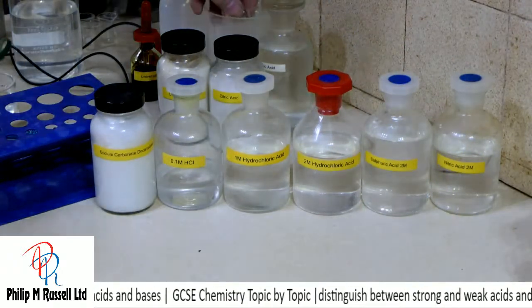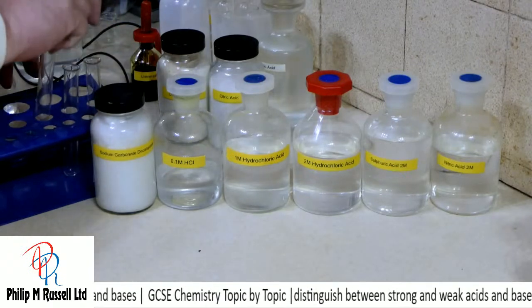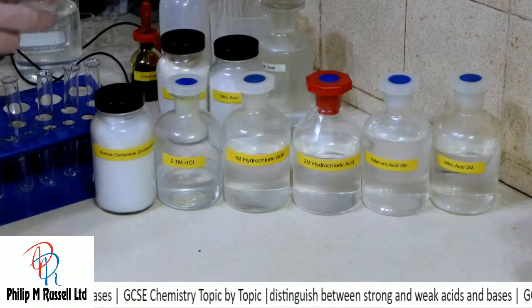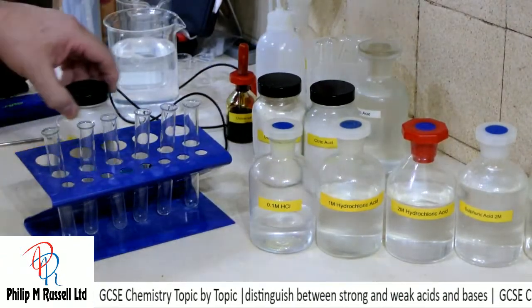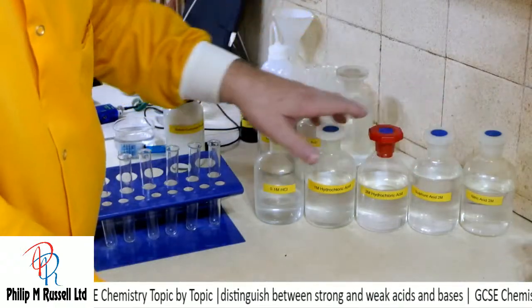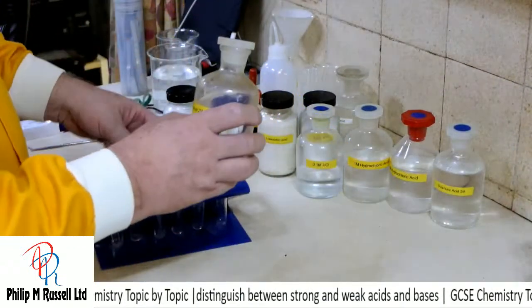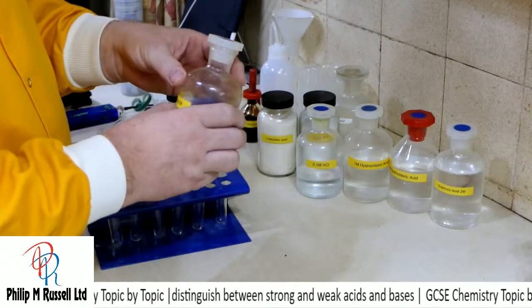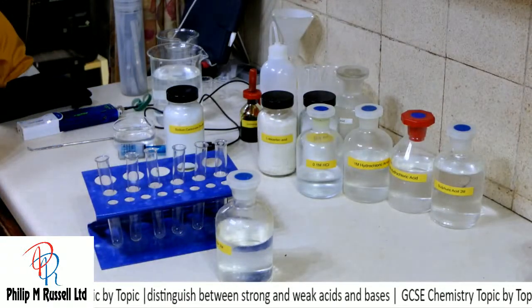Okay, so let's start off. And I'll get a couple of test tubes out. Alright, I'm lying to you. I'm going to get a few out. And let's have a look and see what happens with these. So let's first of all try out a little bit of nitric acid. Now it is important with all these acids to make sure that we're careful with them, but also that we use the same amount.